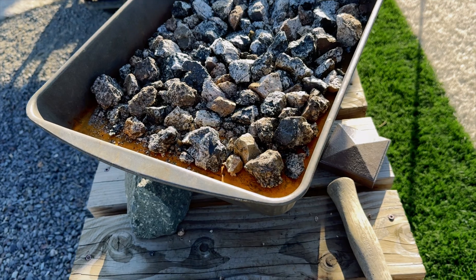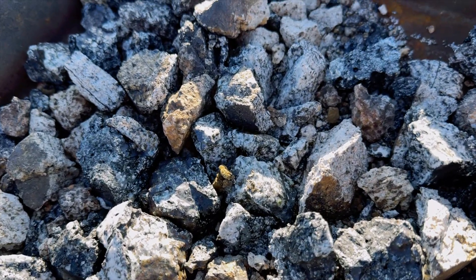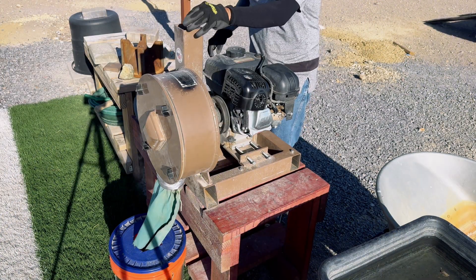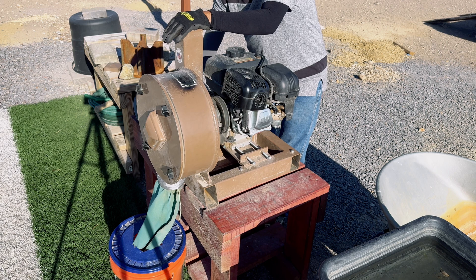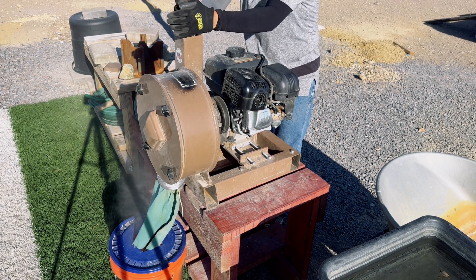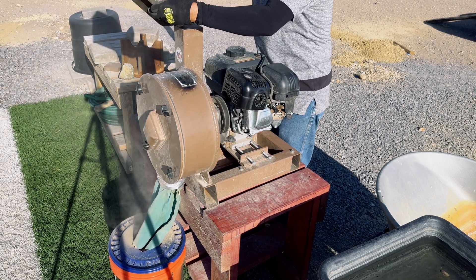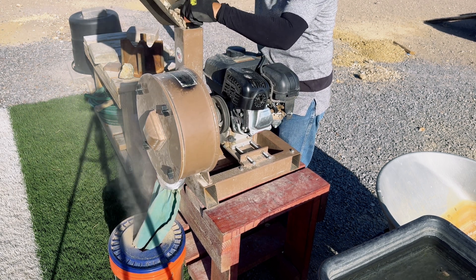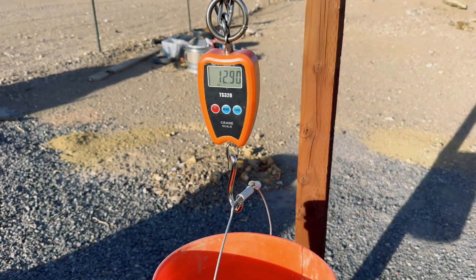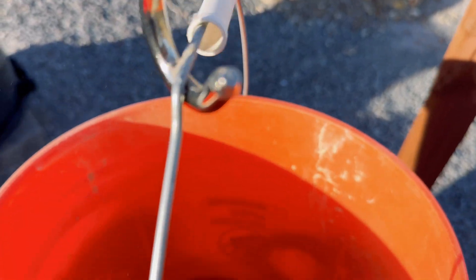Here is our granodiorite that we had cooked in our furnace at 1600 degrees for 30 minutes. Here is our granodiorite that we are going to crush. Our crushed ore weighs 12.9 pounds.